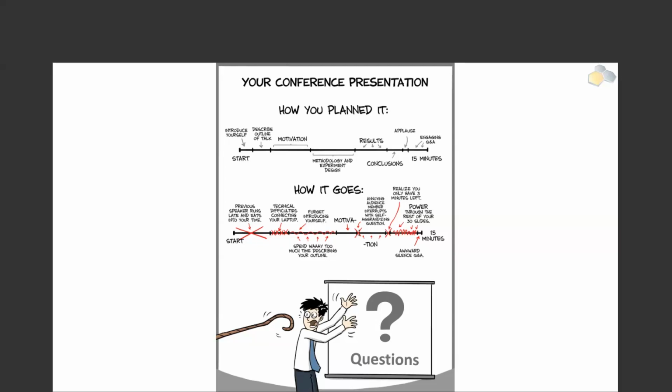There's another question that came in. Did you get a chance to run the DVG pipeline on the HIV data that Duke generated and find any DVGs? I don't remember you doing that, so unless you did it. I can shortly answer that I haven't done that.